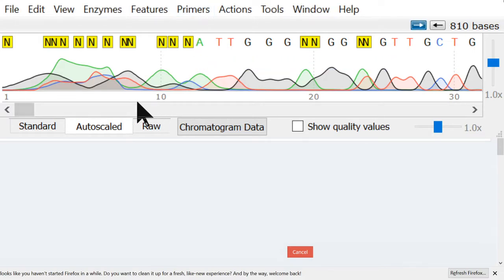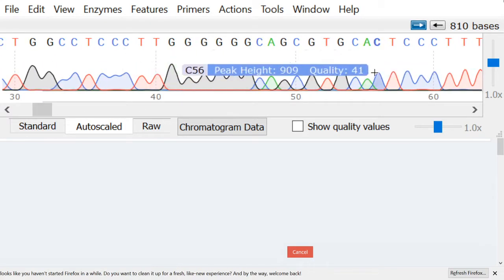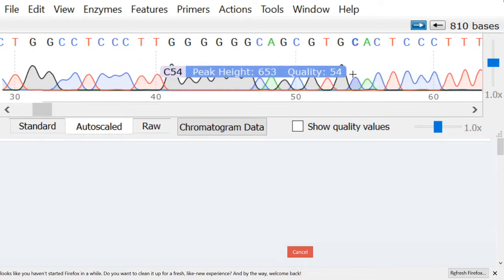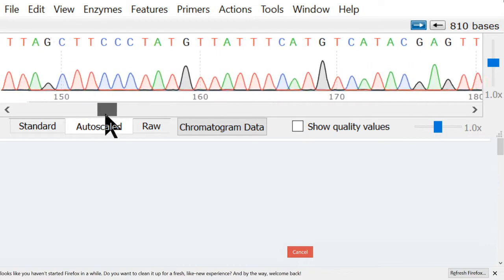So here is this Hygrocybe, and at the beginning of every Sanger read, you get a lot of garbage, and that's just when it's not giving you anything useful. Then you start to get useful data, and after a while these ends go away. Now you have really good data. And good data means nice, reliable peaks, one peak in each spot, no double peaks, no garbage in the background. So what we'll do now is scroll through the read and see how it looks.